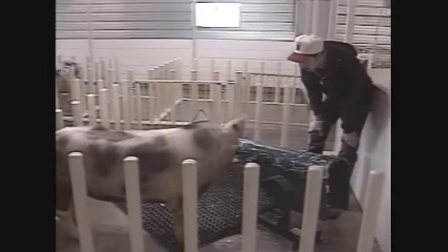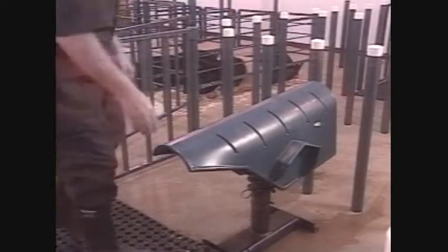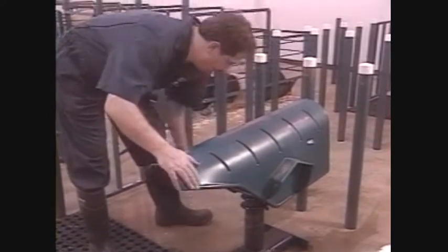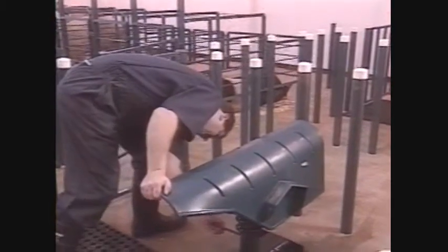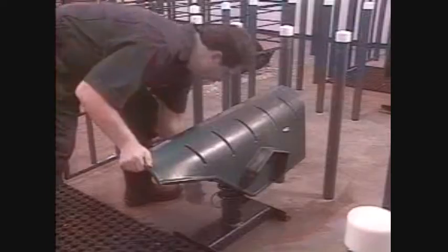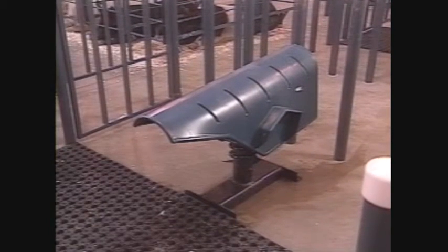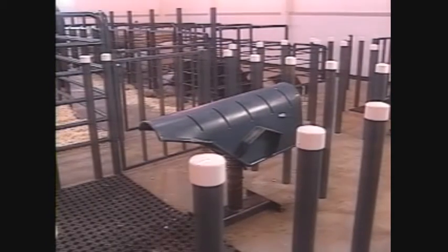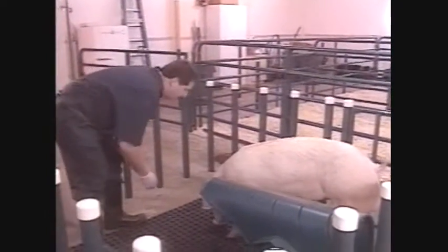Health and safety aspects of boar training must not be overlooked. Always make sure there are two members of staff in the barn or isolation facility during training sessions. Before introducing a new boar to the collection pen, make sure that the dummy sow has been set to a low level. It can help if the collection room has already been used for collections that day and has not been washed down. The presence of boar odor, gel, and saliva can act as a stimulus. Make sure that there are no distractions in the collecting pen, for example, loose matting or a power washer. Be methodical about training boars.